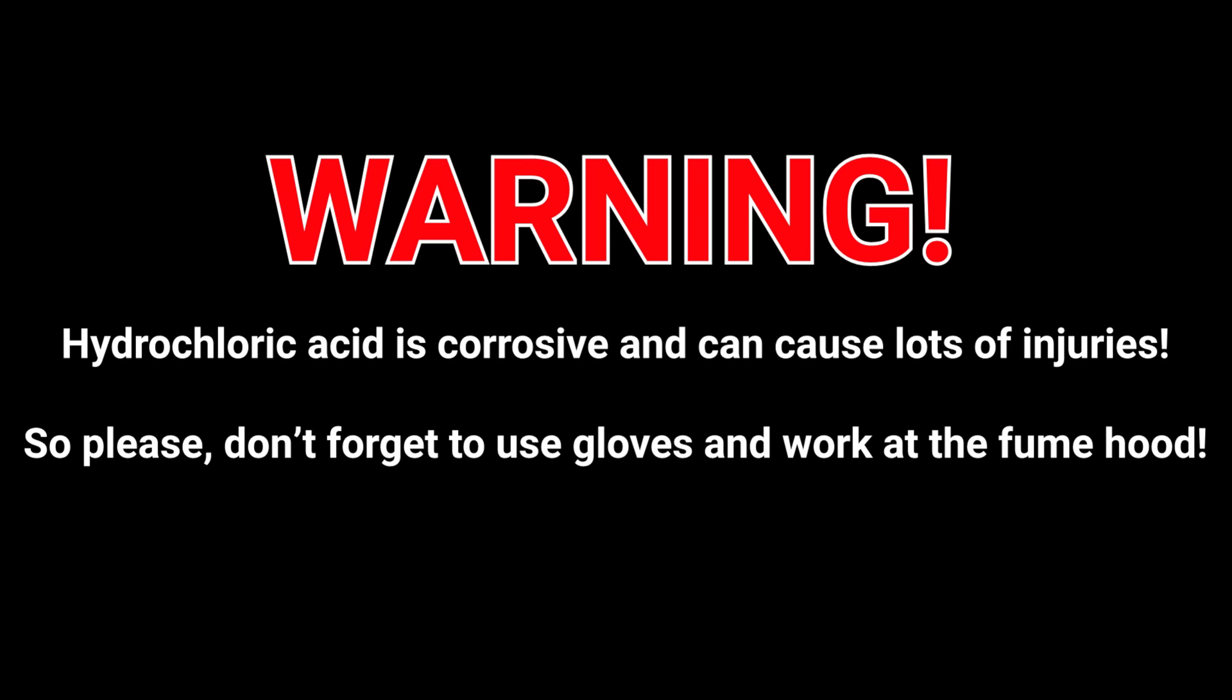Hydrochloric acid is corrosive and can cause lots of injuries, so please don't forget to use gloves and work at the fume hood. Thanks!